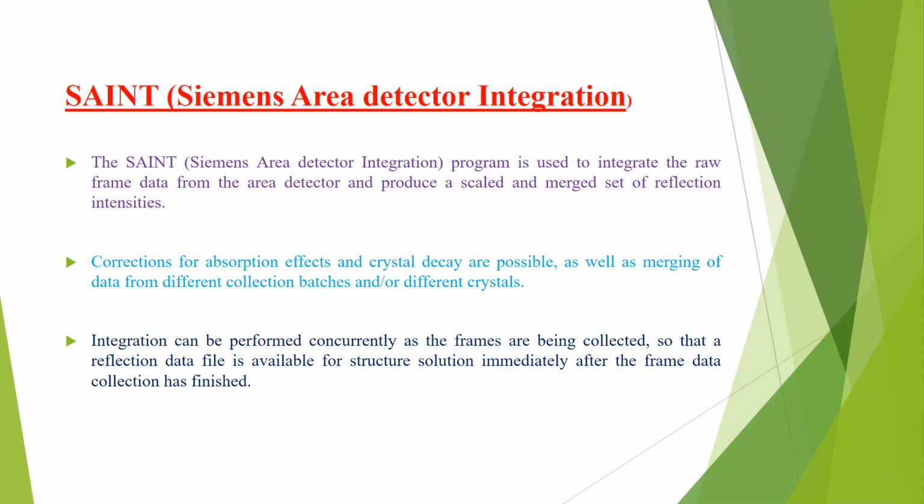So this is another software program which is used in single crystal XRD, and it is used on the computer which is attached to the machine.